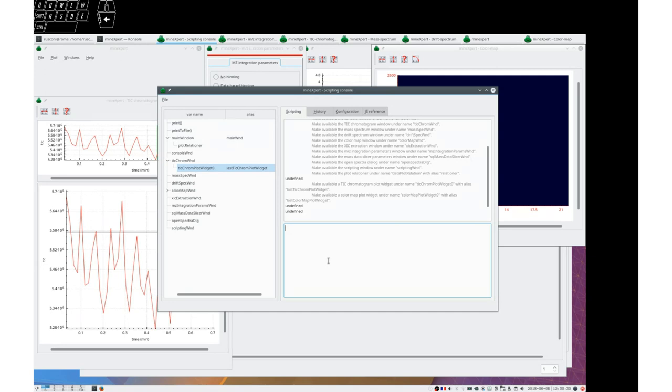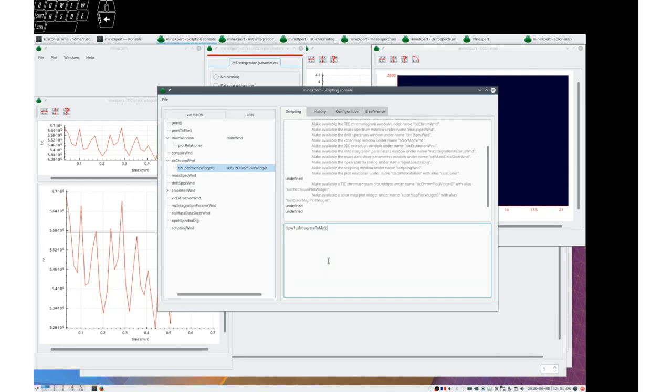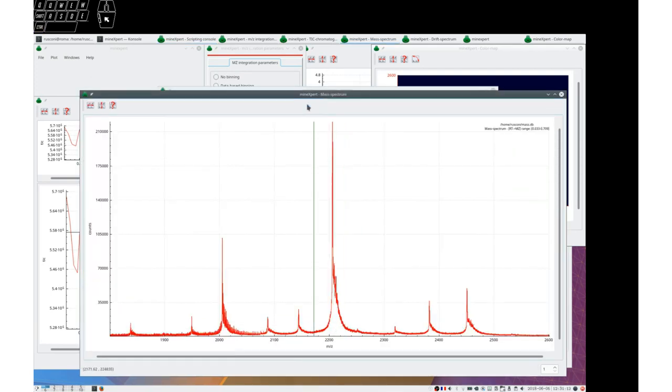So I could say go through the history using alt, up, down arrows. Let's say that I want to Javascript integrate to mz. Control return. You see that it has integrated to mz.